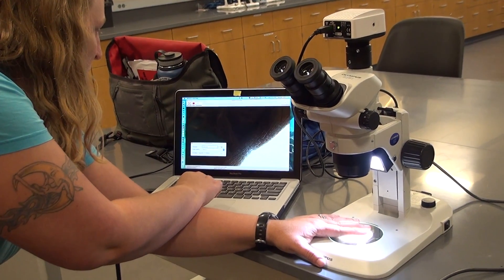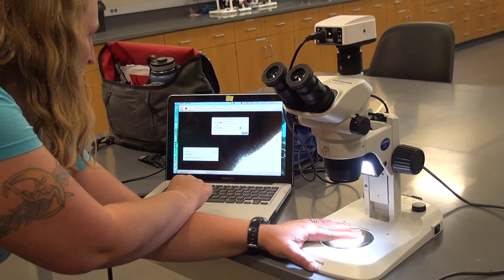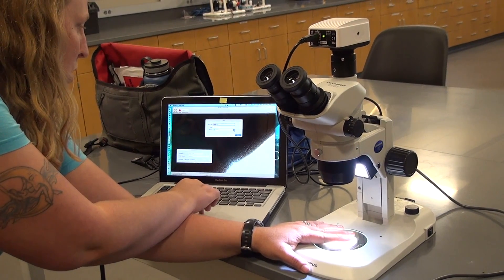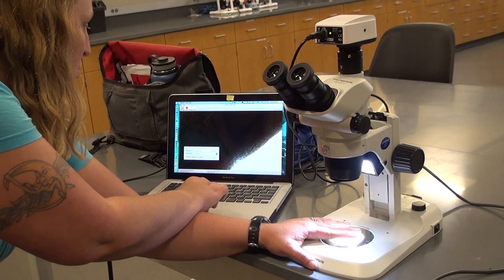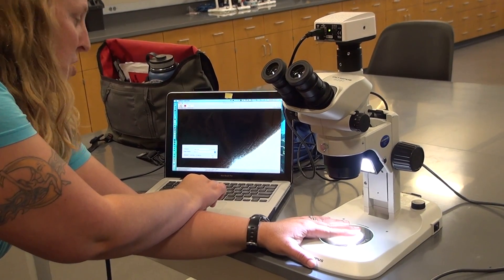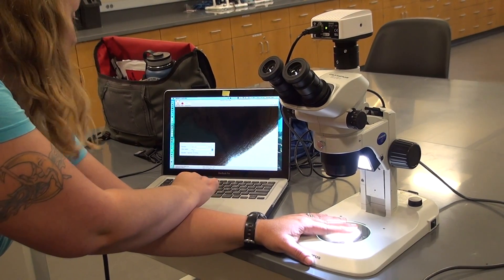And you have to click browse to now save it. So now you save it as an mp4 on your desktop, or wherever you have set it up. And then once you cancel, if you don't click browse, and you just hit start and stop, it will not save your video for you.